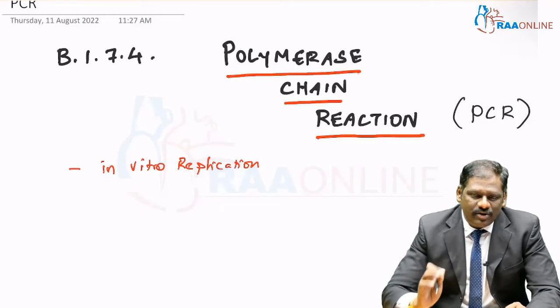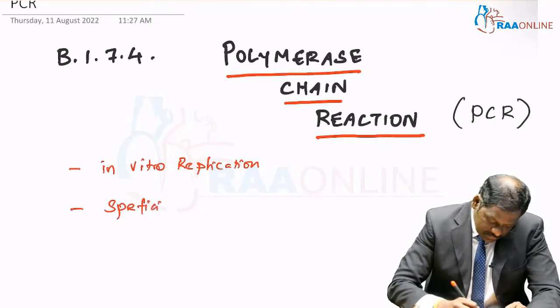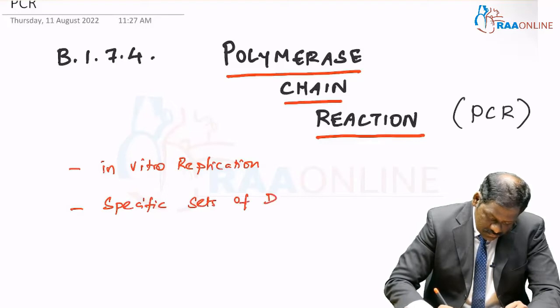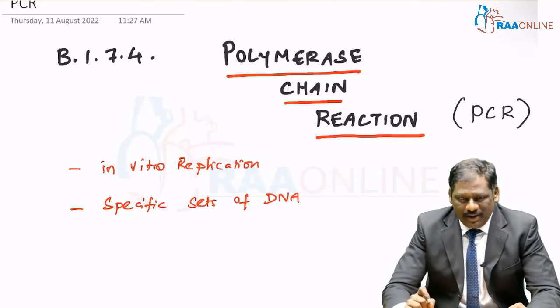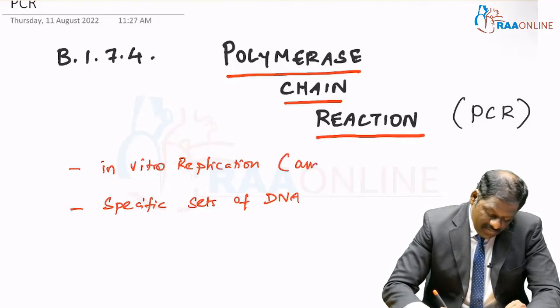So, this is in vitro replication of specific fragments of DNA, the DNA which you want to amplify, otherwise called amplification.